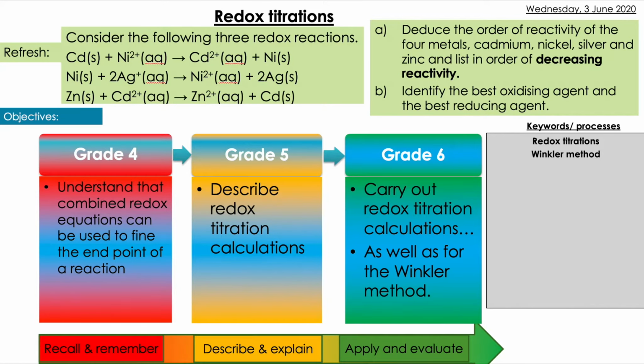Okay, so in this video we're going to look at how these combined redox equations can be used to find an endpoint. We're going to describe redox titration calculations, and then we're going to carry out some of these calculations and also apply them to the Winkler method.